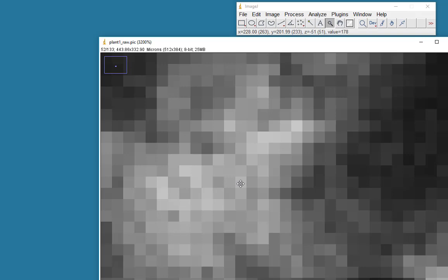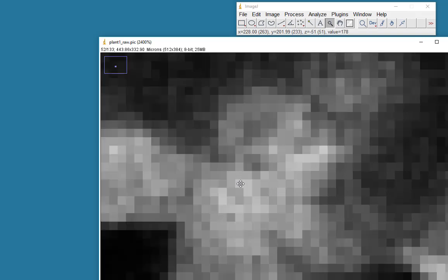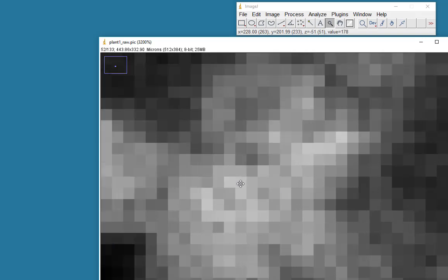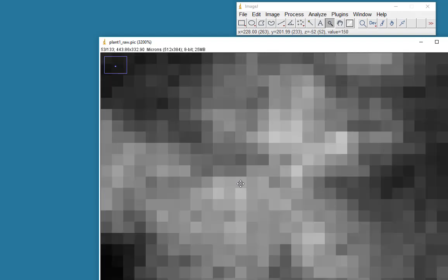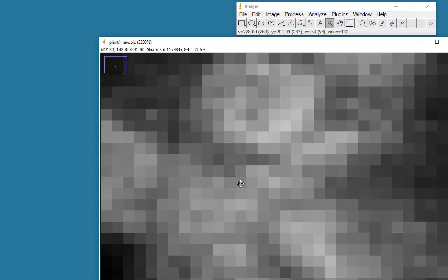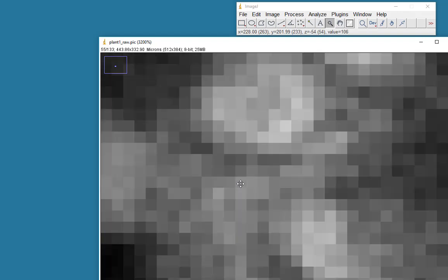And the value of that pixel at that X, Y location and at that Z level, at that slice number, is 178. If I use the arrow keys and move left or right, I can move through the data set.